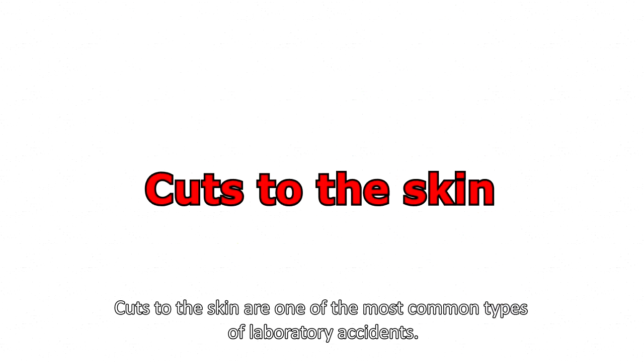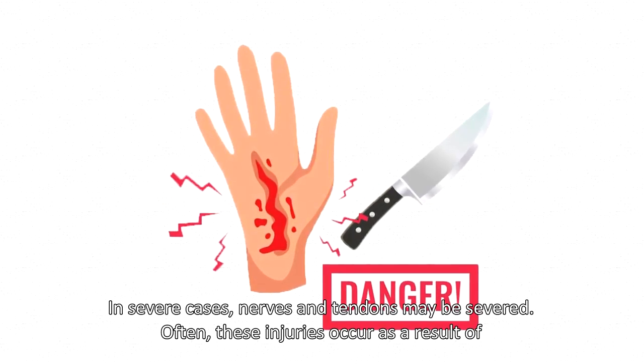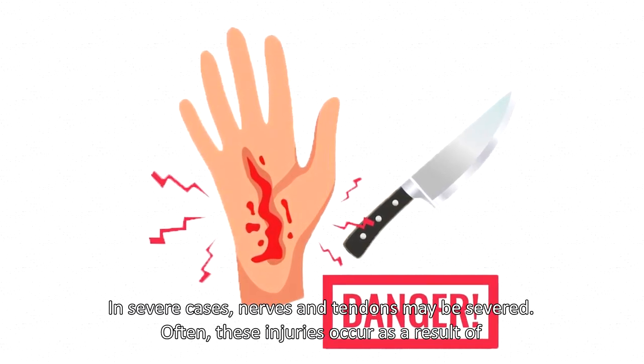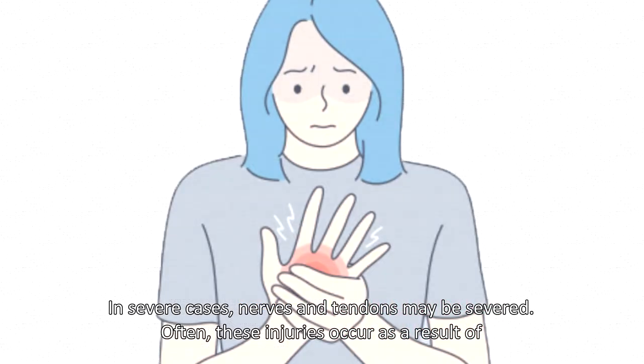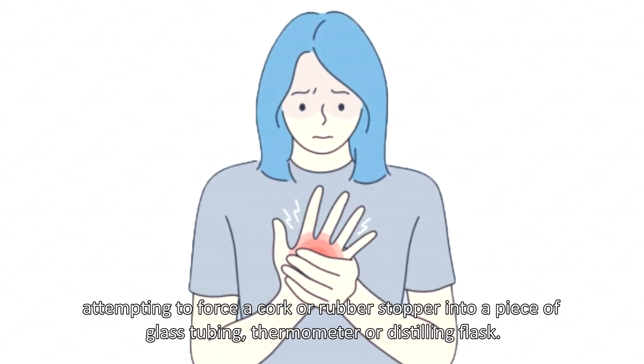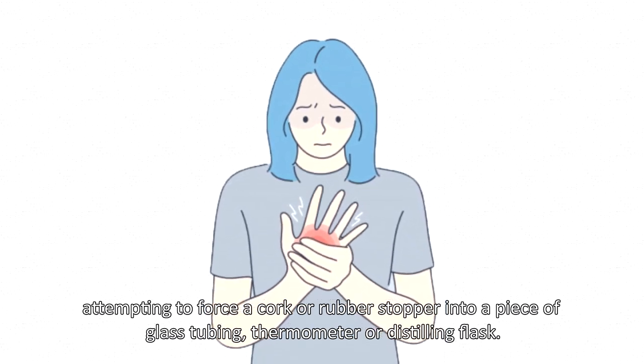Fifth, cuts to the skin. Cuts to the skin are one of the most common types of laboratory accidents. In severe cases, nerves and tendons may be severed. Often, these injuries occur as a result of attempting to force a cork or rubber stopper into a piece of glass tubing, thermometer, or distilling flask.